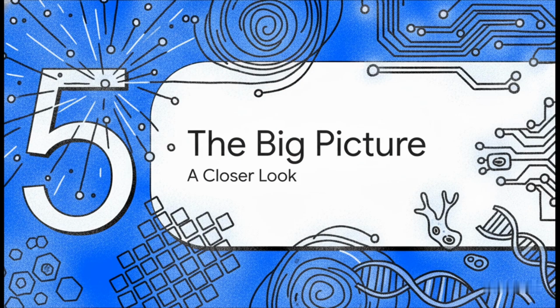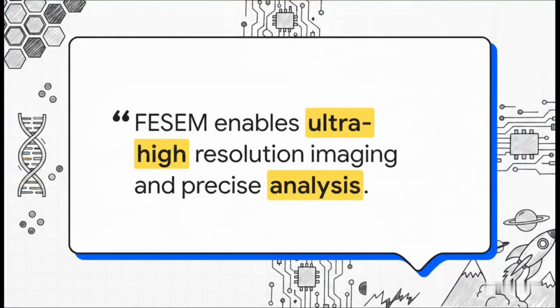The big picture, a closer look at the future. Ultimately, as this says, the FESEM enables ultra-high-resolution imaging and precise analysis of surfaces and nanostructures across a wide range of scientific and industrial applications. It's not just a fancy camera, it is the foundational bridge between human curiosity and the nanoscale universe. Whether we're trying to cure a new disease, build a radically faster computer, or engineer stronger, lighter materials for space travel, the FESEM is the tool that lets us verify our work and truly understand our world.